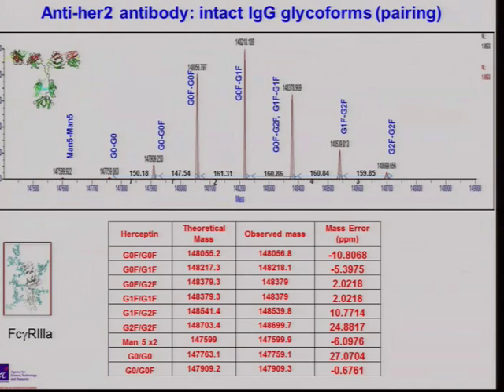So a glycoform is a single amino acid sequence and a single sugar at each of the glycosylation sites. That's what defines a glycoform. So if you look at one protein, one IgG molecule, what actually do you see? And just knowing the population of glycans doesn't give you that information, but this does. It really helps you to understand what this whole molecule looks like.